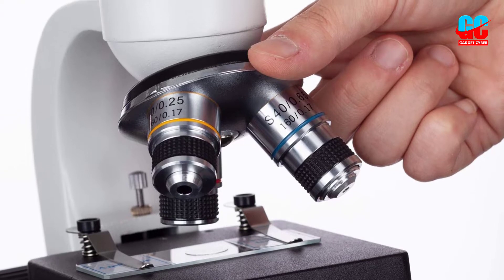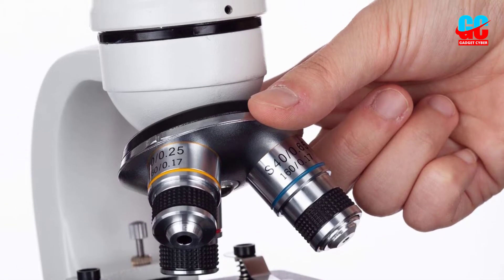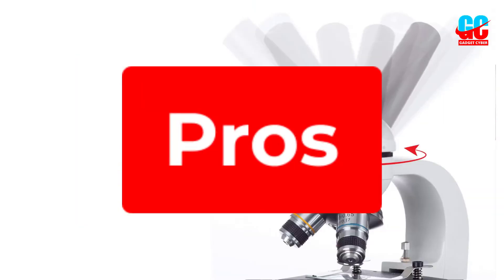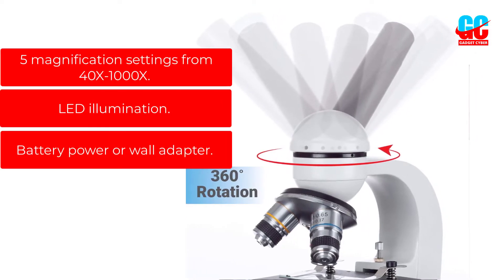While this microscope is great for users of all levels, it didn't include any sort of instructions, so beginners may be a bit confused as they try to find their way around the microscope the first time. Pros: 5 magnification settings from 40x to 1000x.